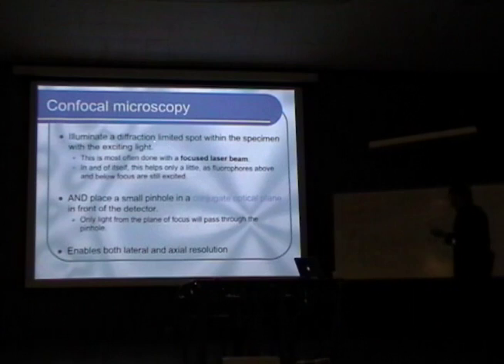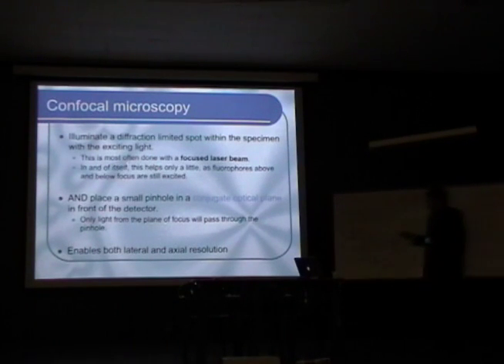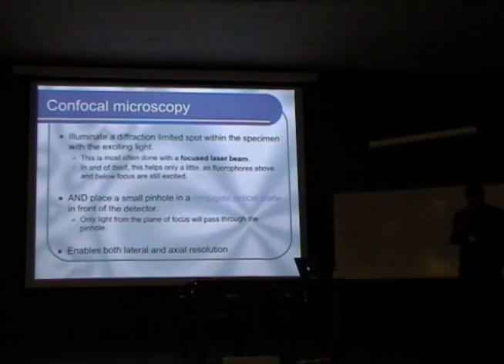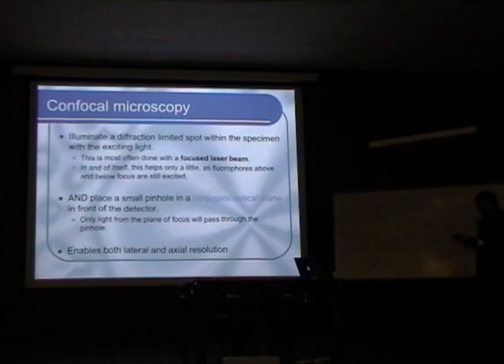The main idea of confocal microscopy is that one can probe the sample point by point and then reconstruct the image by using computer software, for example. In order to do such imaging of the sample, typically one utilizes the focused laser beam and also fluorescent dyes, just like in fluorescence microscopy.